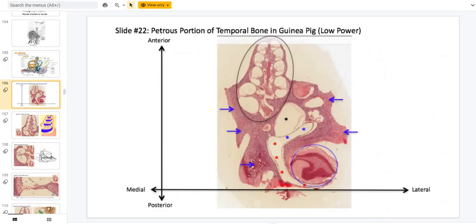Here are the axes of the slide we're going to be looking at. The top of the slide is the anterior portion, to the right is lateral. That means the superior and inferior axis is coming out of the computer screen and going in, so we're either looking down or looking up at this two-dimensional slice.